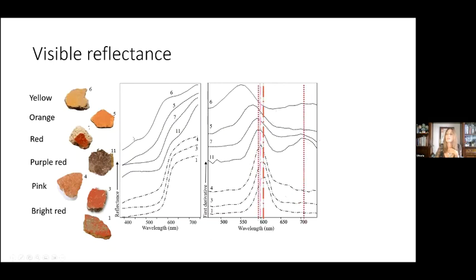What is immediately noticeable is the clear difference between the general trends in the spectra of iron-based pigments, with cinnabar. In the case of the light sample, the flex point is quite shifted with respect to the red and violet ones, as you can see there.